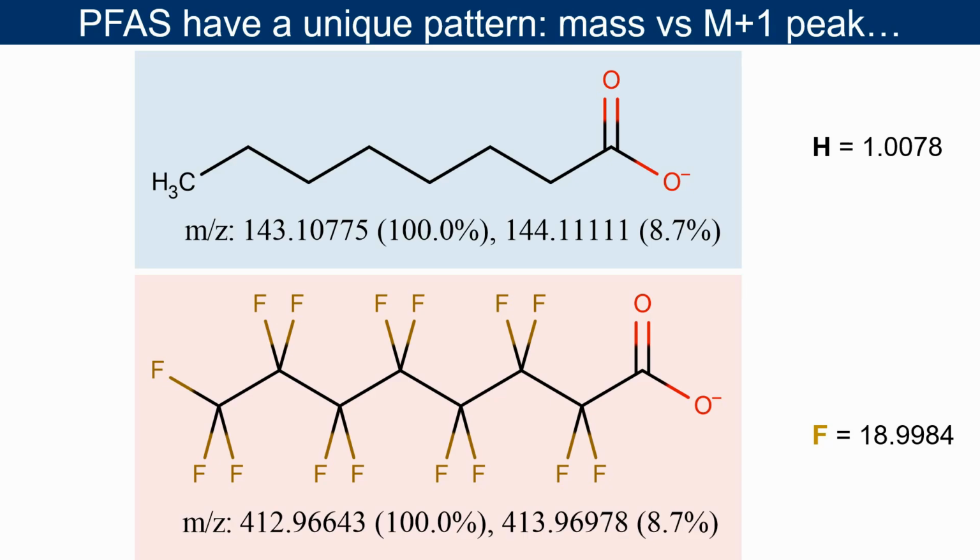Now here, we'll look at the example that we pulled up before in previous tutorials of the fatty acid octanoic acid versus PFOA on the bottom. So same molecule, except PFOA replaces those hydrogens with fluorine.